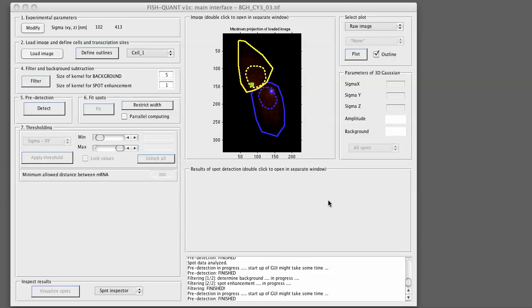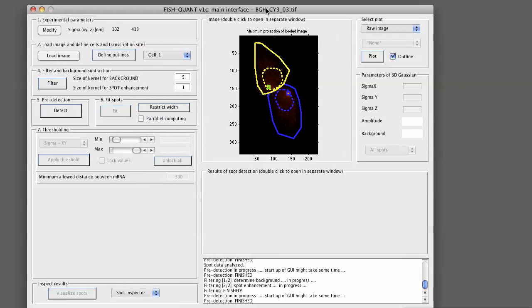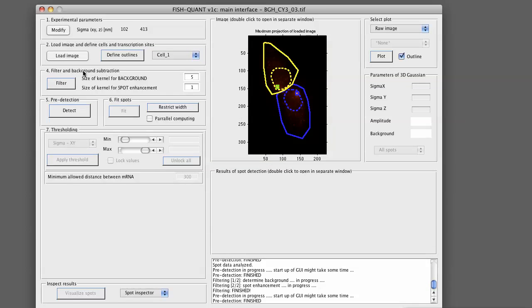So how do we do the filtering? It is controlled here in this panel. We implemented this as a two-step convolution with a Gaussian kernel. First we convolve the image with a large Gaussian kernel to get a background image. This image will then be subtracted from the raw image.